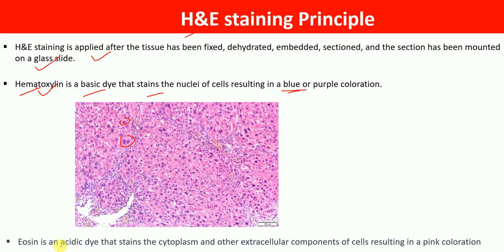Eosin is an acidic dye that stains the cytoplasm and other extracellular components of the cells, resulting in pink coloration. The pink coloration you see here represents the eosin stain, indicating the cytoplasm or extra-nuclear components. With H&E staining, we can nicely visualize the cellular structures present in the tissue section.